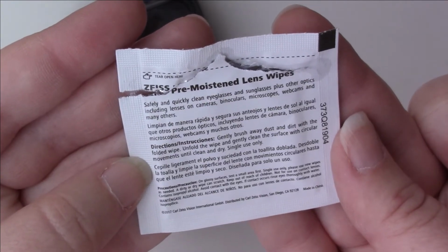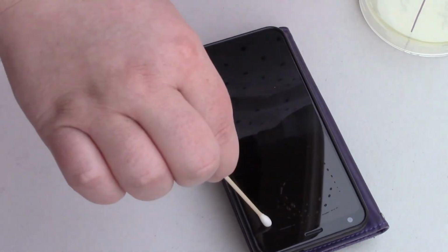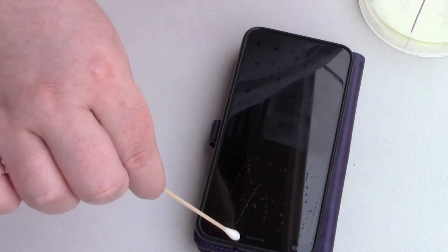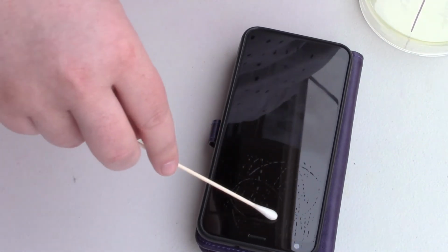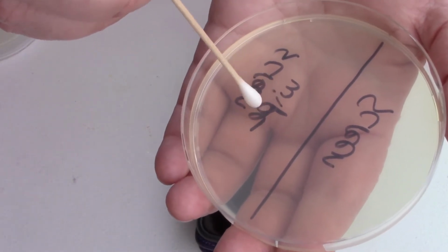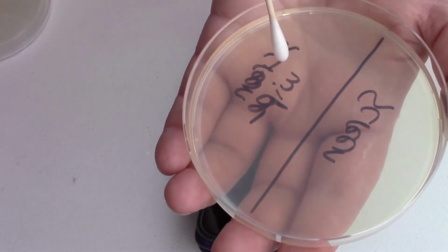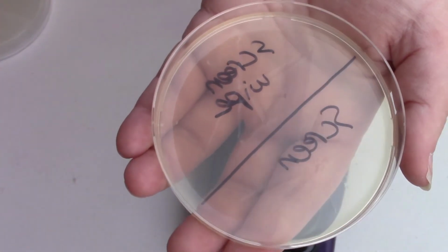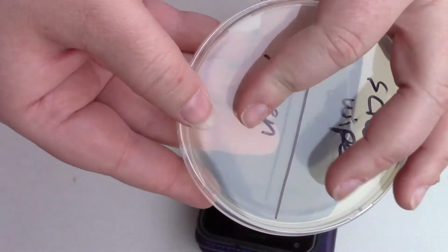Alright, so using a new cotton swab. And again, trying to get a good amount of the inside and the edges, and only doing the section that the wipe has touched. And again, doing our sun rays. Sorry if you can hear the pitter-patter of rain outside. It has been raining for a few days. All right, closing it up, turning it over.